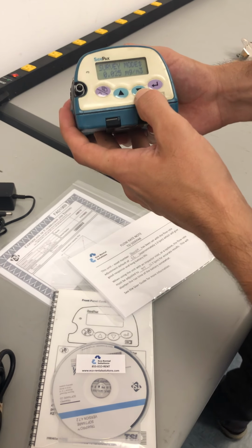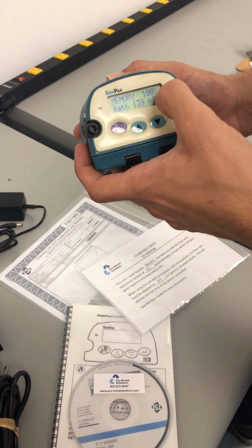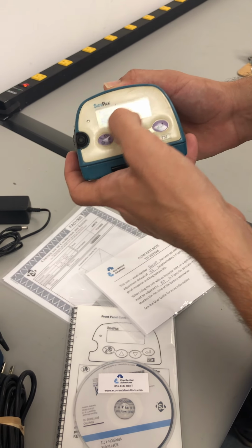So let's see. As we go through here, I believe we should be able to see a memory percentage left if you were data logging, and then here it has your battery.